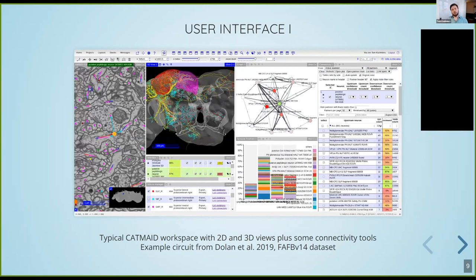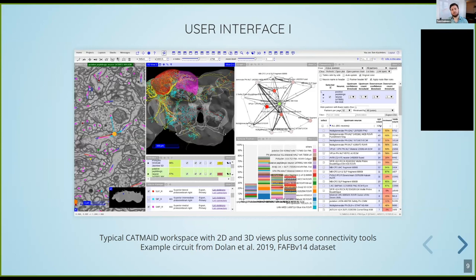This is a screenshot of a common CatMate environment, which as I mentioned is a web application that runs in the browser. It comes with its own tiling window manager and many interconnected tools. In this example we see the grayscale imagery on the left — one of those electron microscopy slices — and biologists go through this data to mark and follow individual neurons, mark synapses, and connect individual neurons. The magenta dots on the left-hand screenshot are intersections of the image plane with those neurons.